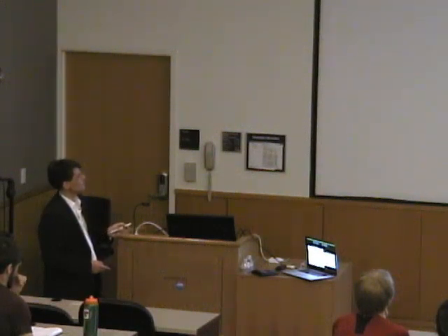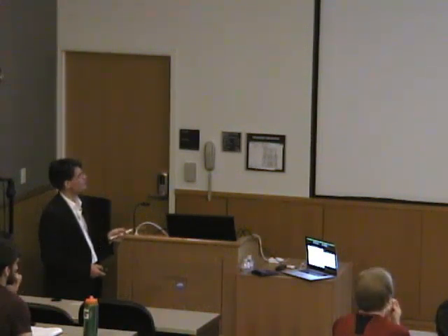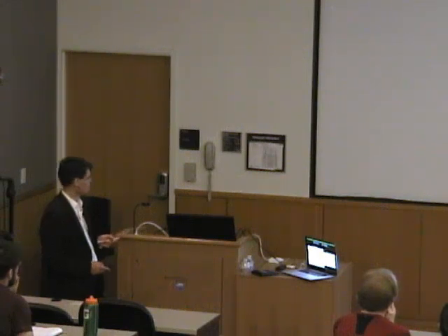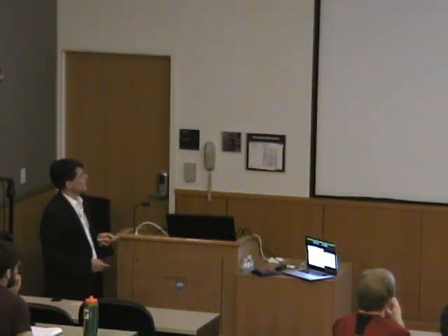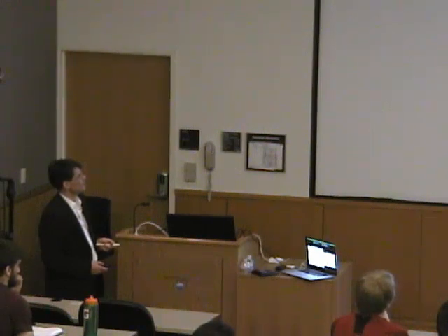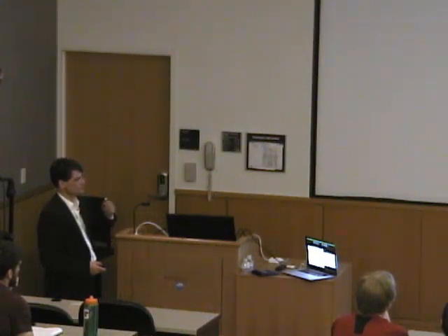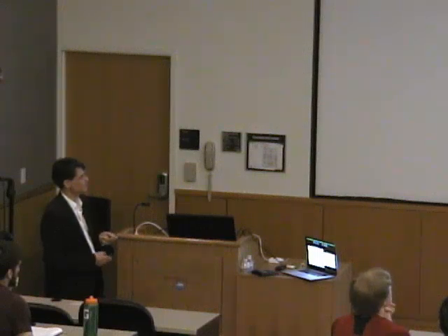That is an equation that you can very easily use. If you're used to fitting EPR spectra, you can easily use this equation to fit MCD data. At the time we tested that, so Carsten, can I go 5 more minutes and leave 5 more minutes for questions? Yeah? Okay. So that theory makes a definitive prediction about the MCD, for example, of high spin hemes that have an S equals 5/2 ground state, and so you will have 3 Kramers doublets, and the 3 Kramers doublets will contribute to the MCD spectrum.